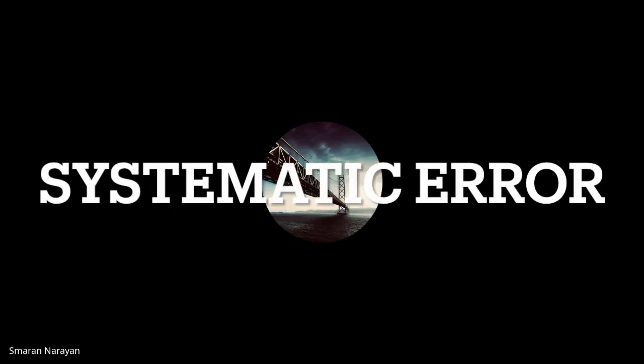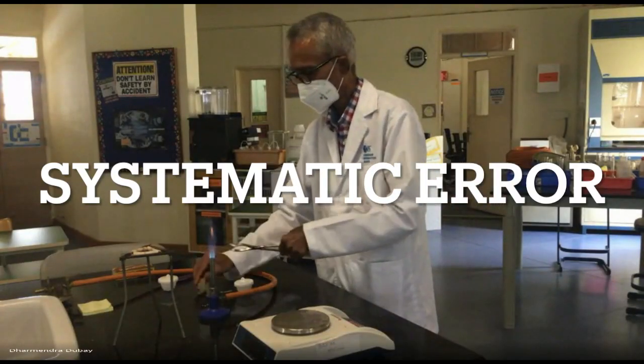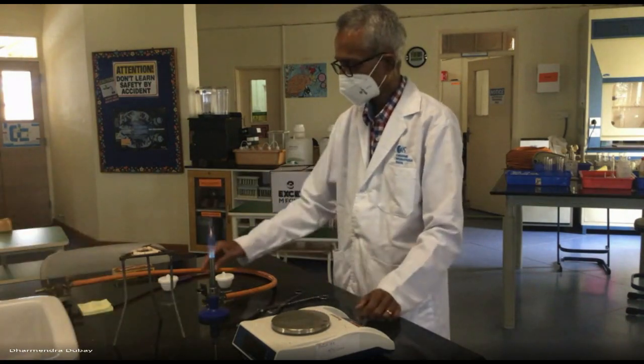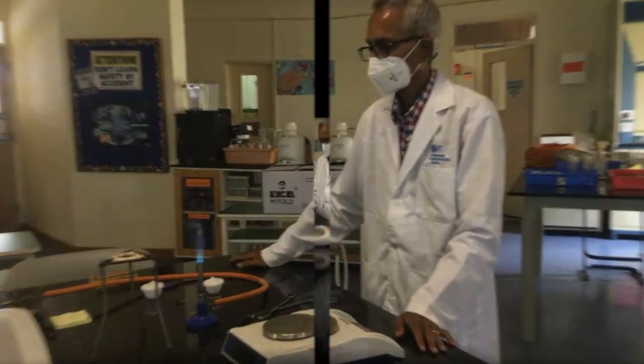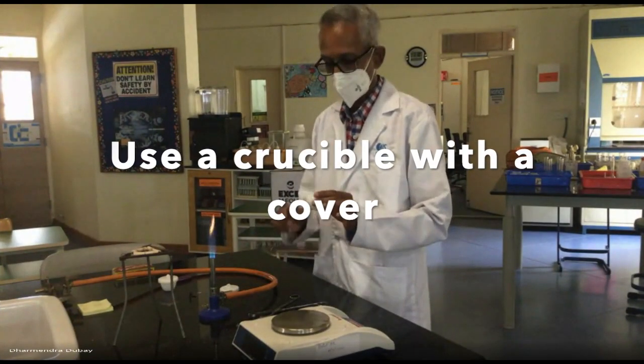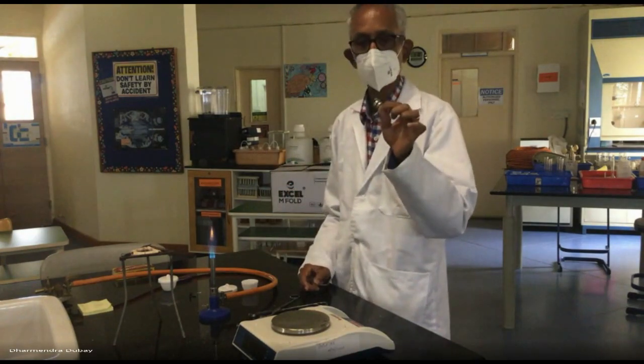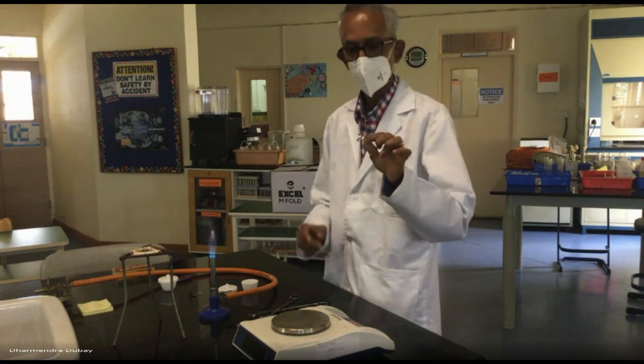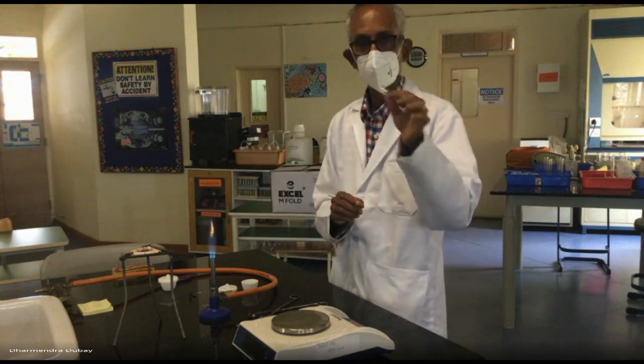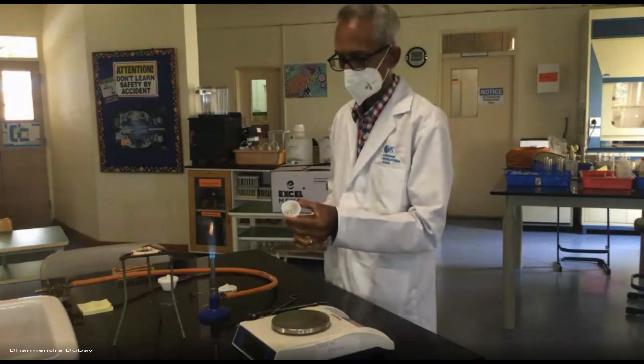Systematic error. We are going to be consistently losing mass from what we should have. Some mass is going to stay on the tongs, some of it is going to go into the air. So, there's got to be a better way. We will be burning the ribbon in a crucible. This ribbon I've taken is about 15cm in length. And I've laid it and also I've coiled it. See that this sits well inside the crucible.